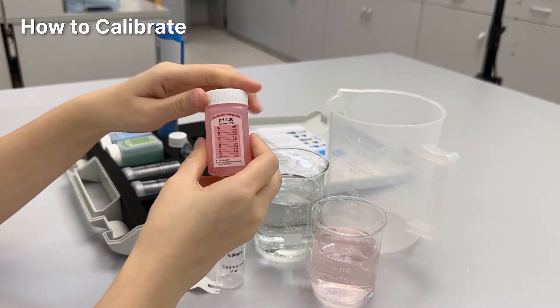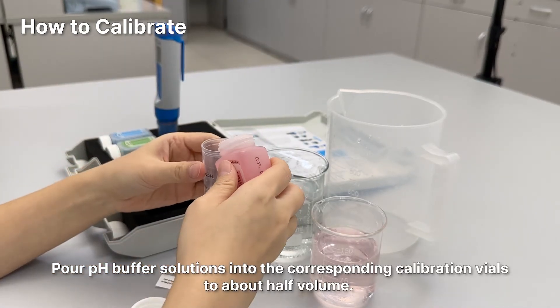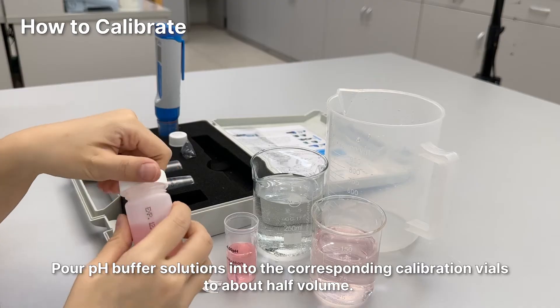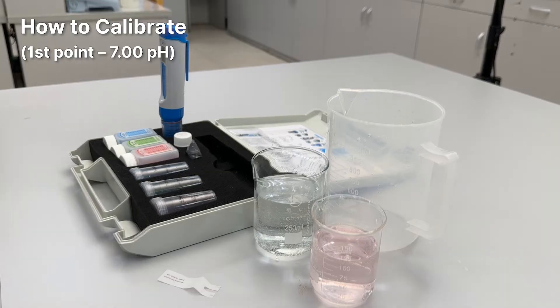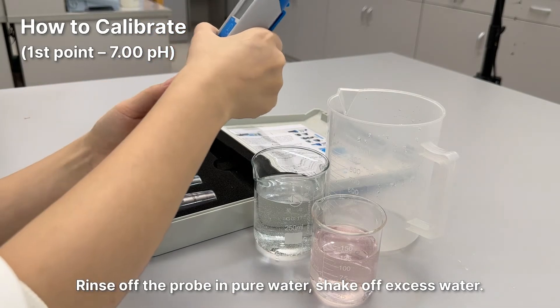pH calibration: pour pH buffer solutions into the corresponding calibration vials to about half volume. Rinse off the probe in pure water and shake off excess water.